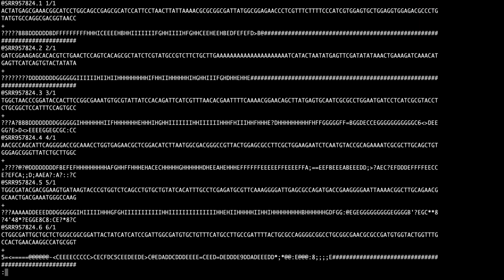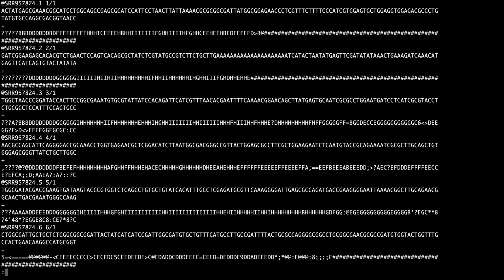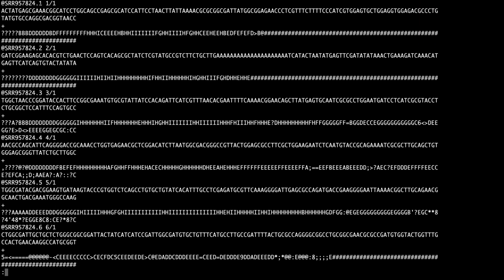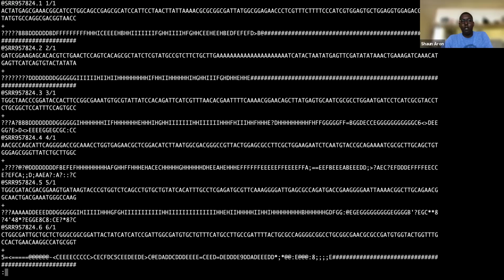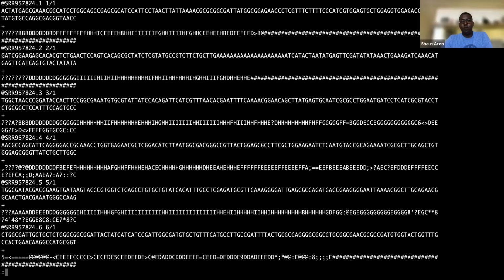Okay, and basically this is now what's in that particular file. So remember I said that for every sample, we will have two files if we have done paired end sequencing. So this is the first file with the forward reads. You'll see that there's this 1 at the end, showing that it's the first forward reads. Okay, we have our header, we have our sequence, we have our additional line, and then we have our quality scores that are ASCII encoded.